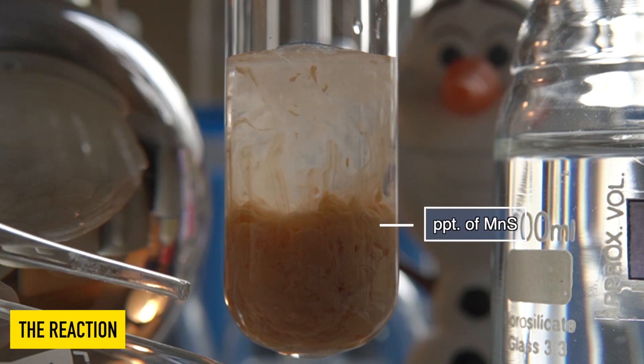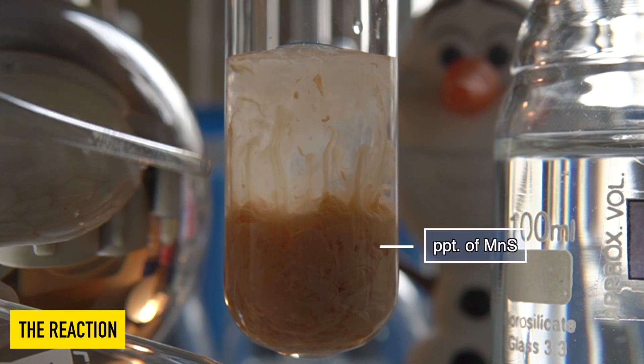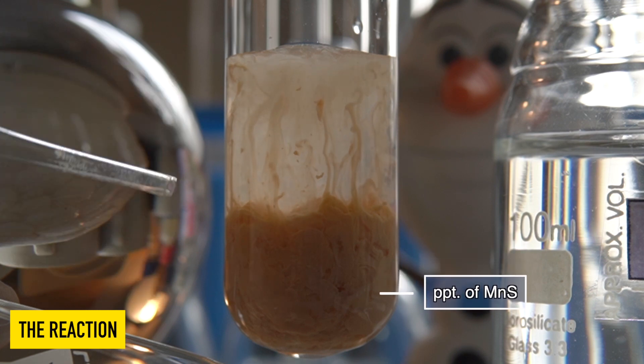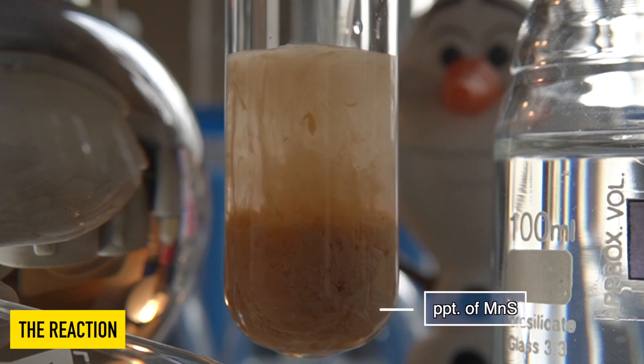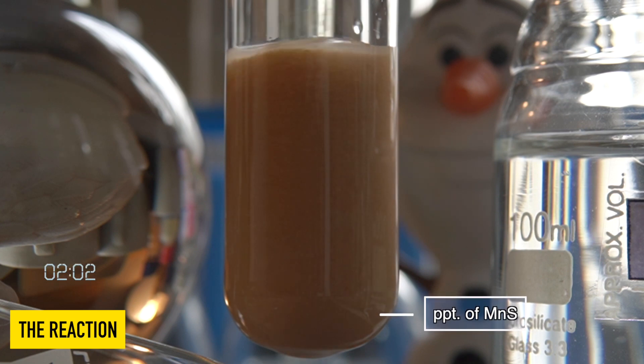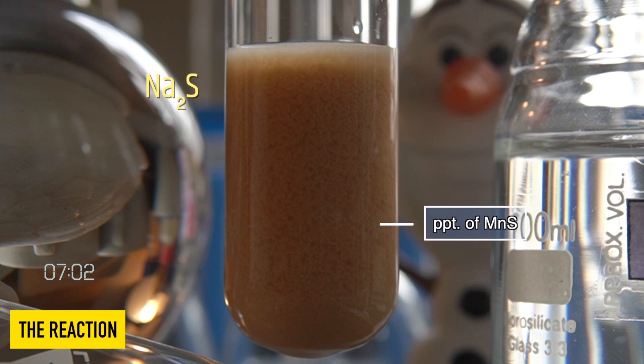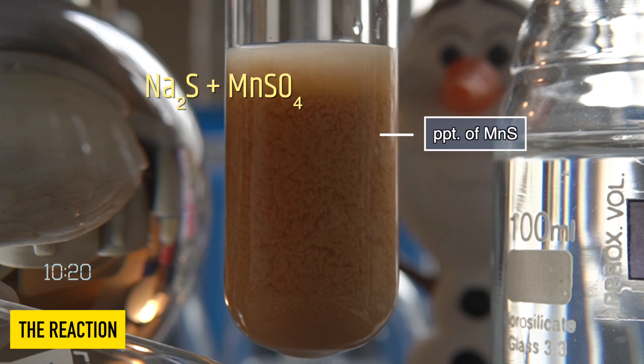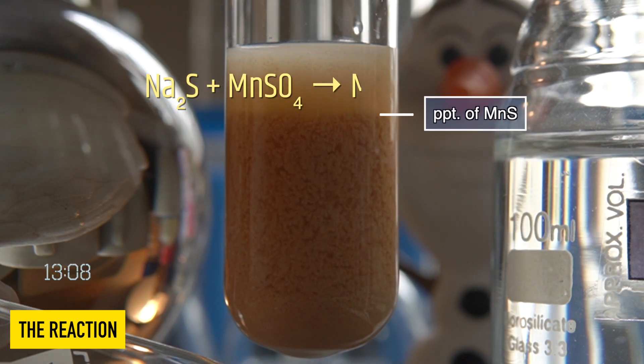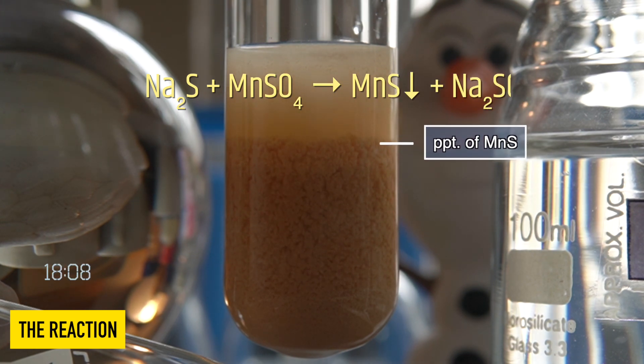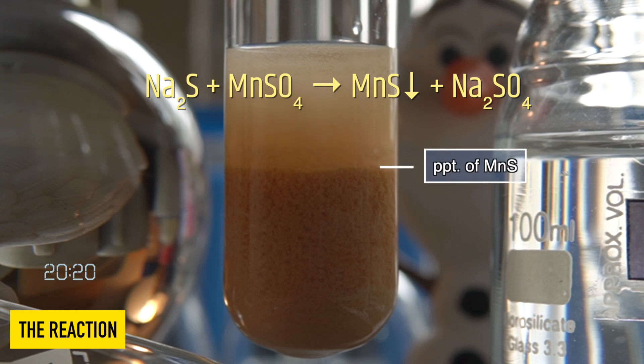The pink insoluble precipitate that has been formed at the bottom of the test tube is nothing but manganese sulfide. So in this reaction, sodium sulfide reacts with manganese sulfate to produce an insoluble precipitate of manganese sulfide along with sodium sulfate.